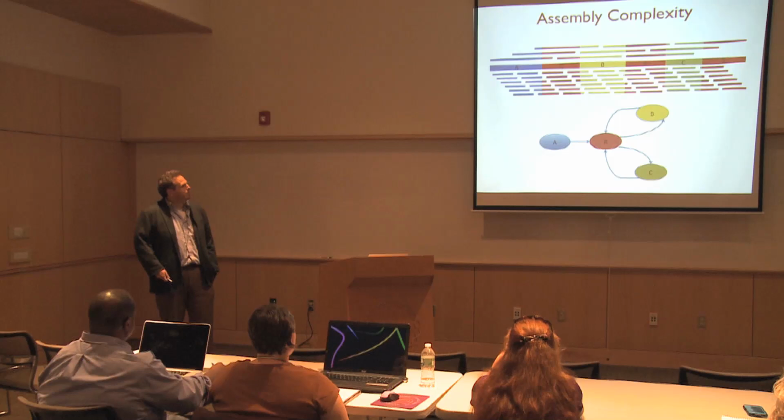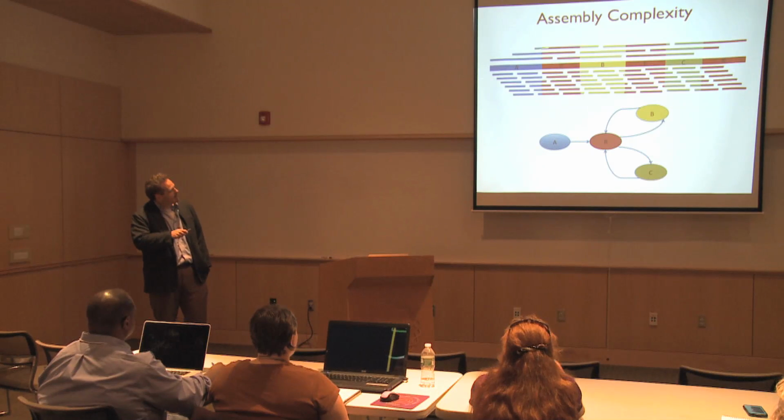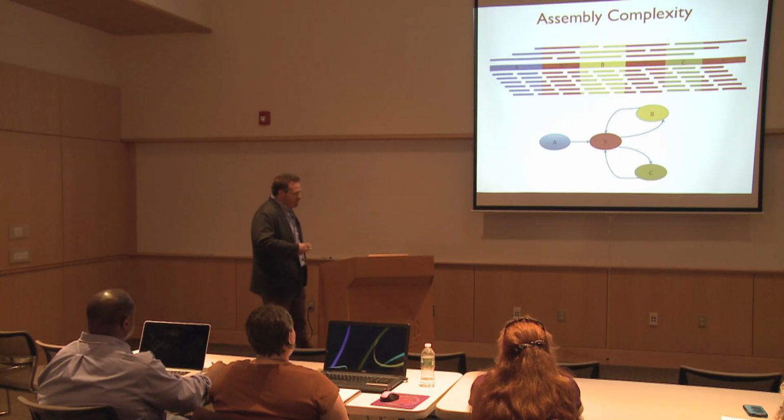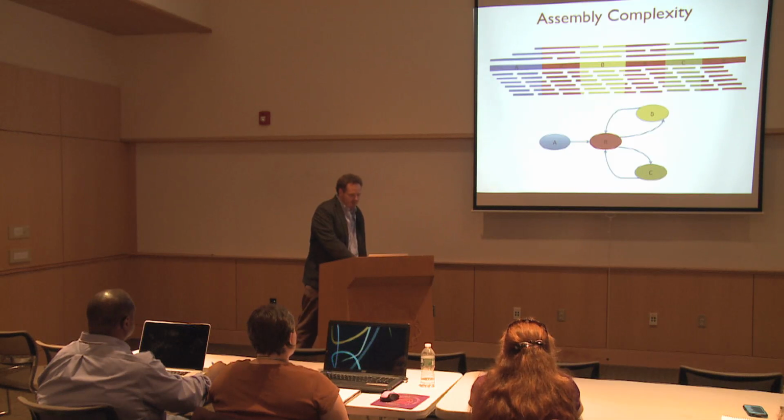From the point of view of the assembler, what that does is, if you start with some sort of complicated graph like this, you can think about taking these long reads and squinting at it and saying, oh, well, it starts in this A, and then it goes through this repeat somehow, it comes out on B. That sort of analysis is exactly what happens inside the software.